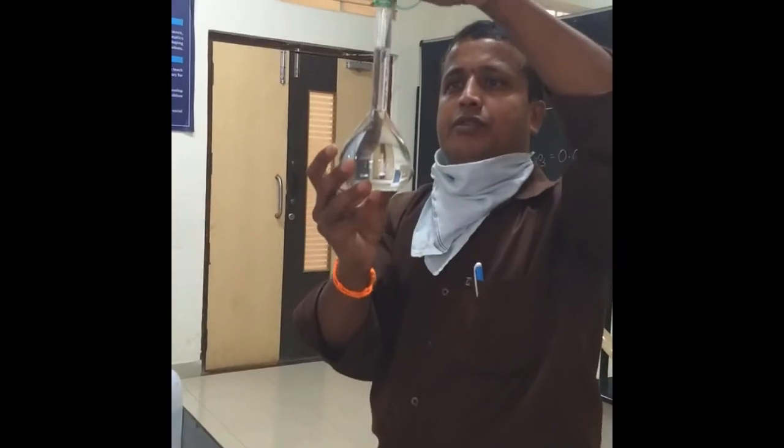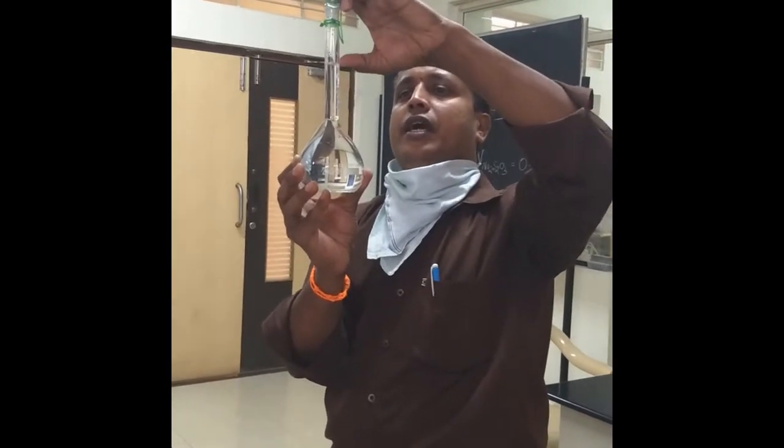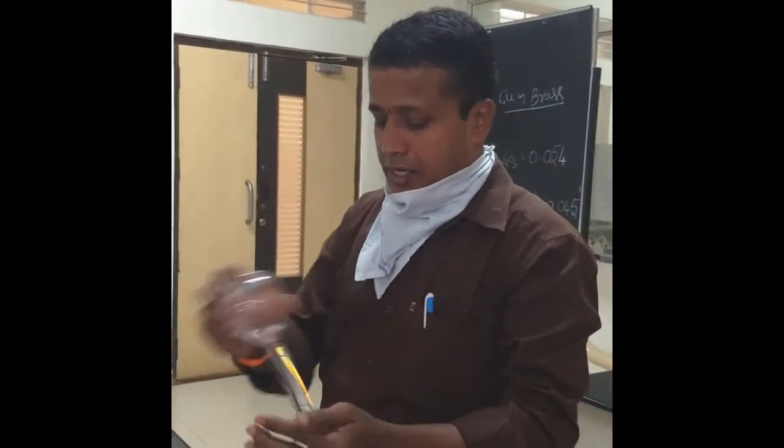Now it is made up to the mark. The lower meniscus should coincide to the line. Now you have to shake it well for uniform concentration by putting this stopper.